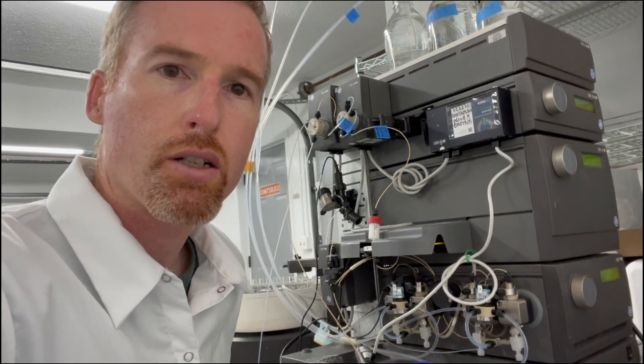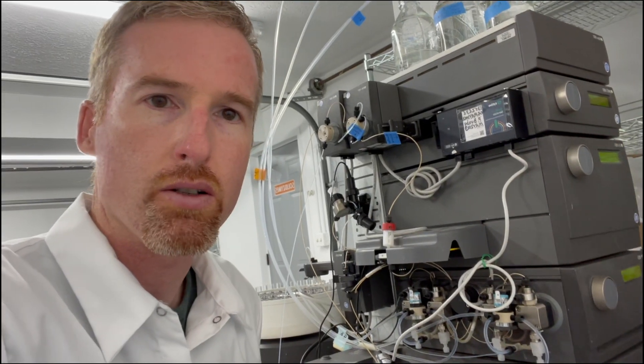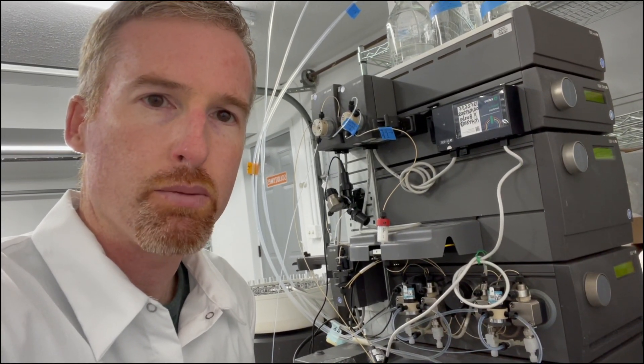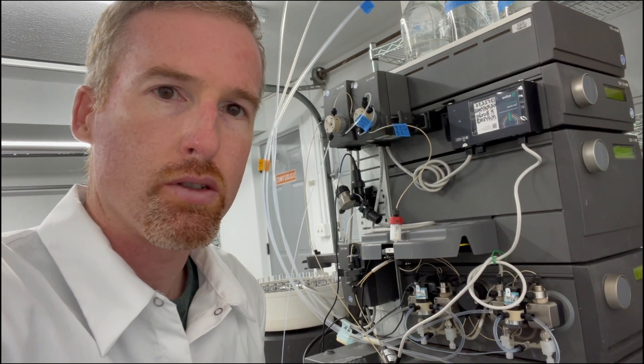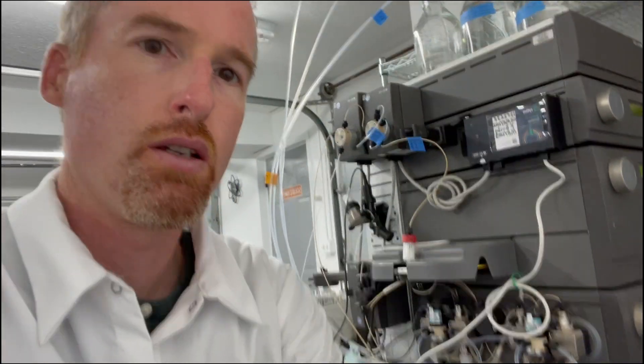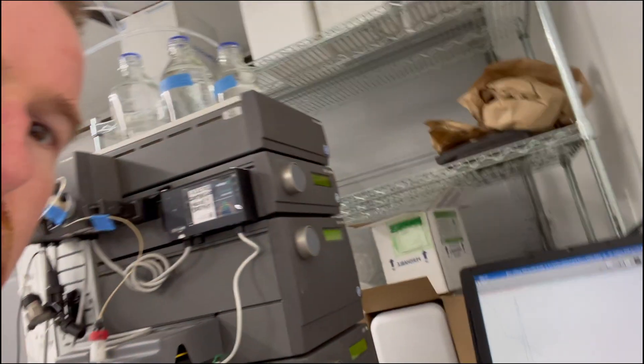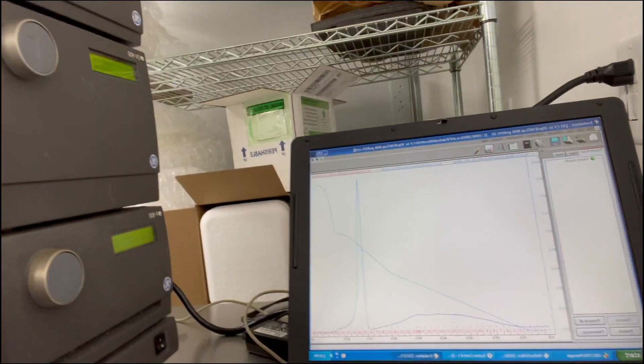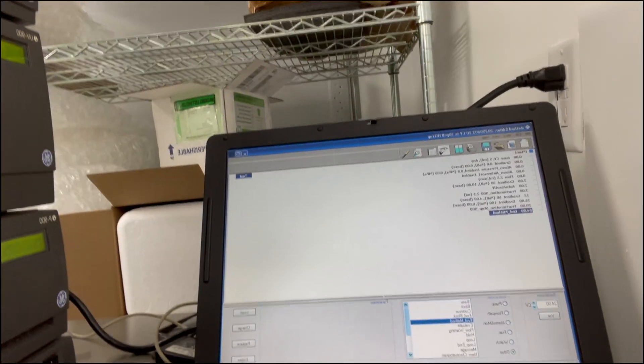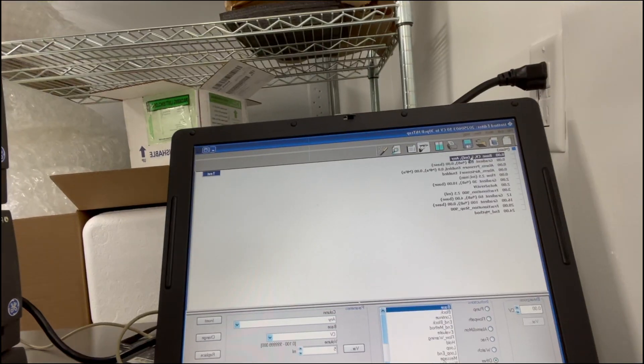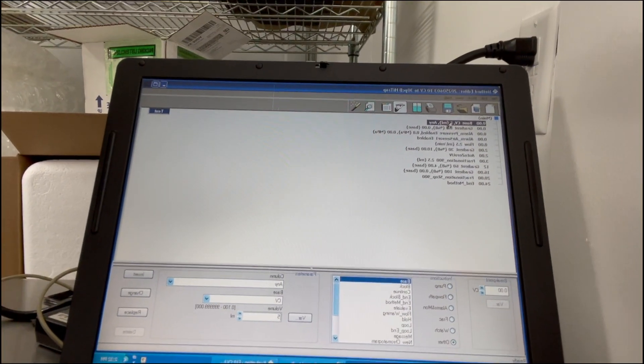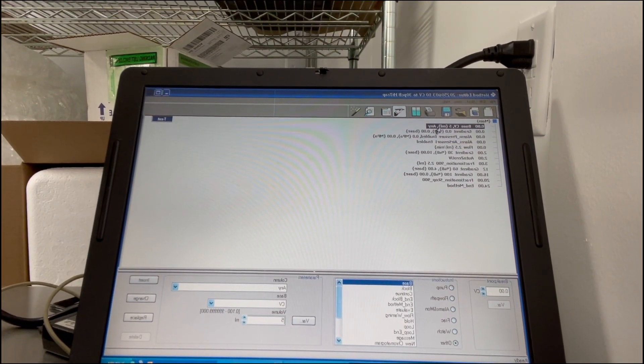Okay, so I'm not going to go over everything you need to know to run an FPLC, but I want to show you the program that I used to elute this protein in the Unicorn software here. So in the method editor you can see I set the base CV to five because it's a five mil column.